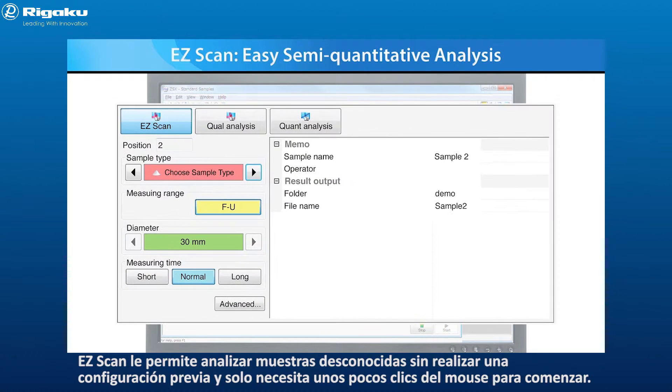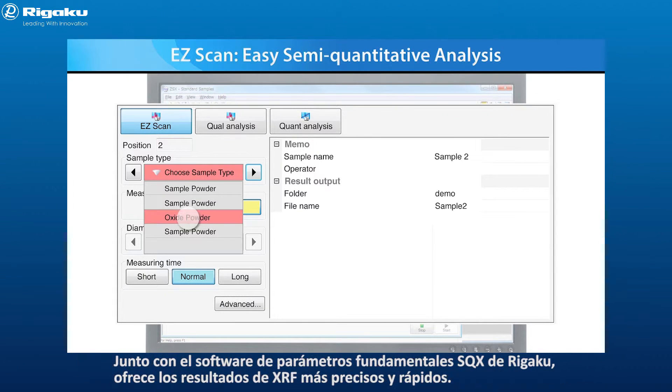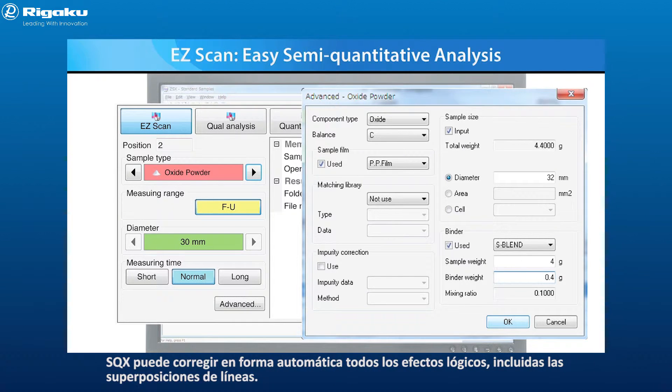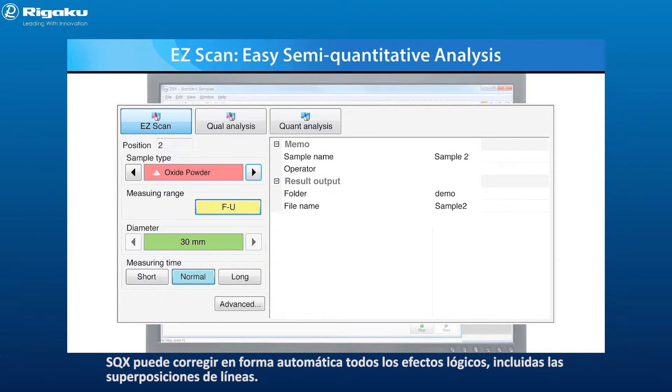Easy Scan allows you to analyze unknown samples without any prior setup, and with only a few clicks of the mouse to get started. Combined with Rigaku's SQX Fundamental Parameters software, it provides the most accurate and rapid XRF results possible. SQX is capable of automatically correcting for all matrix effects, including line overlaps.